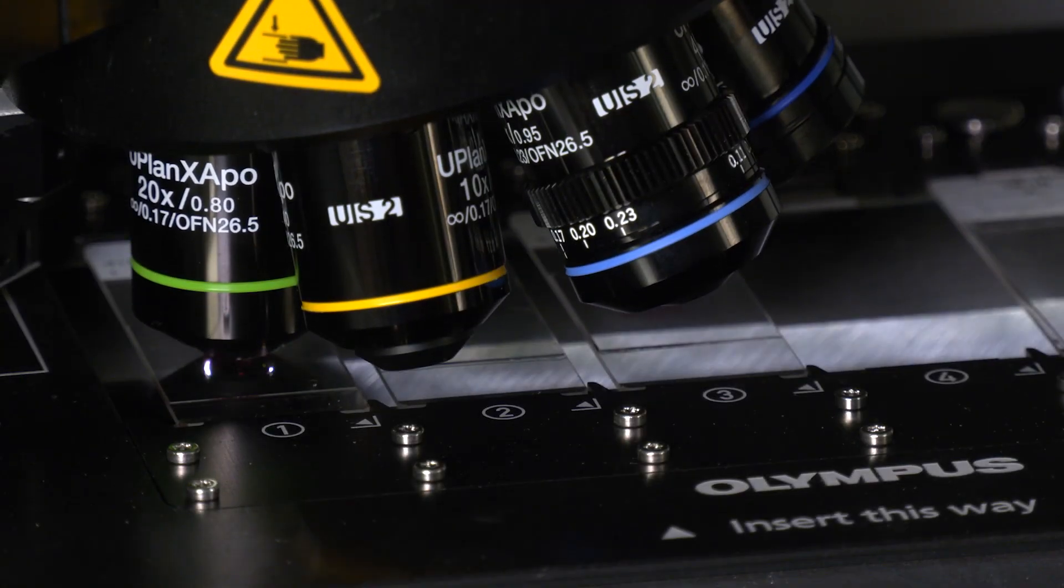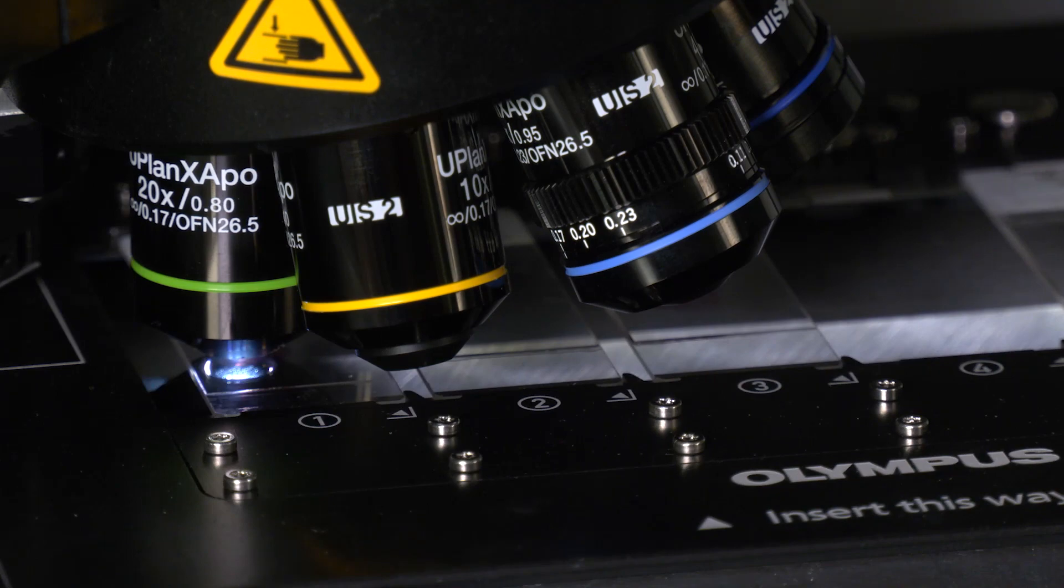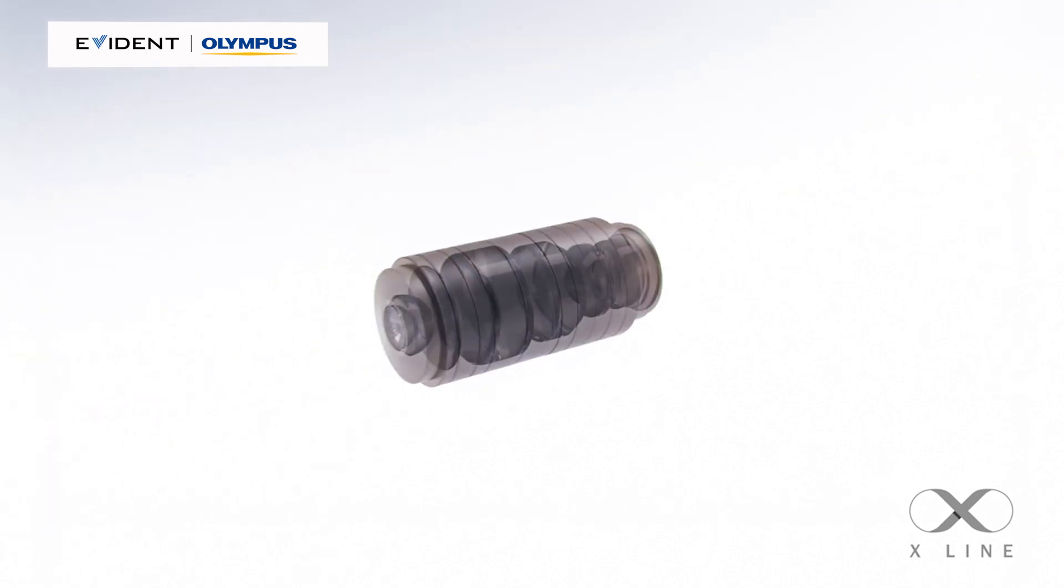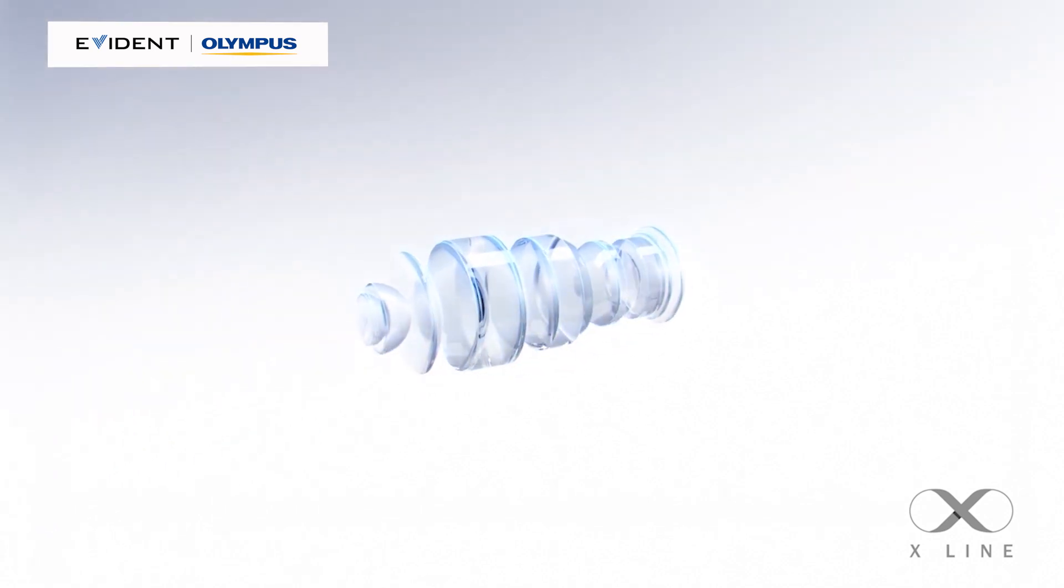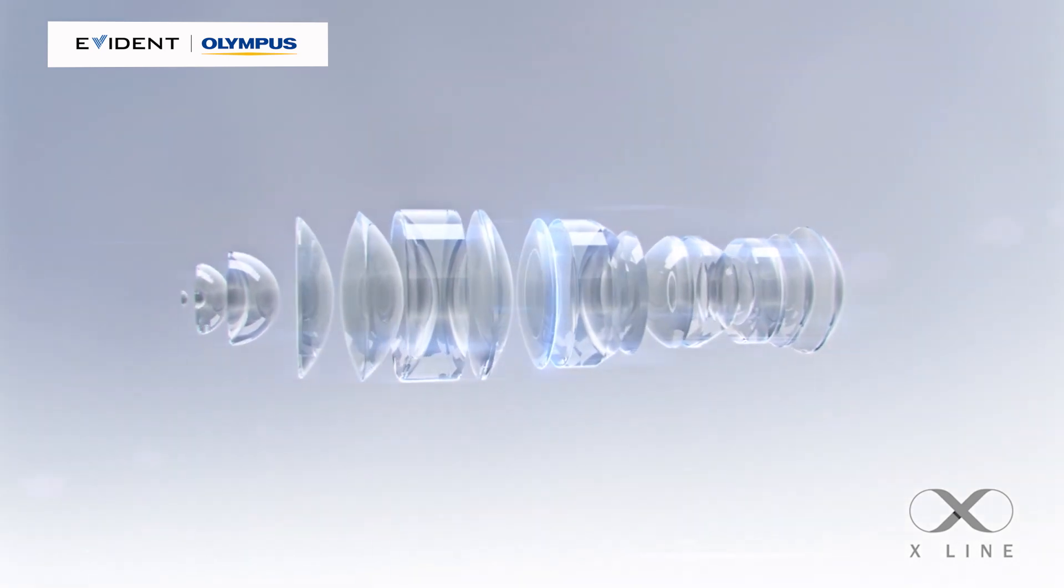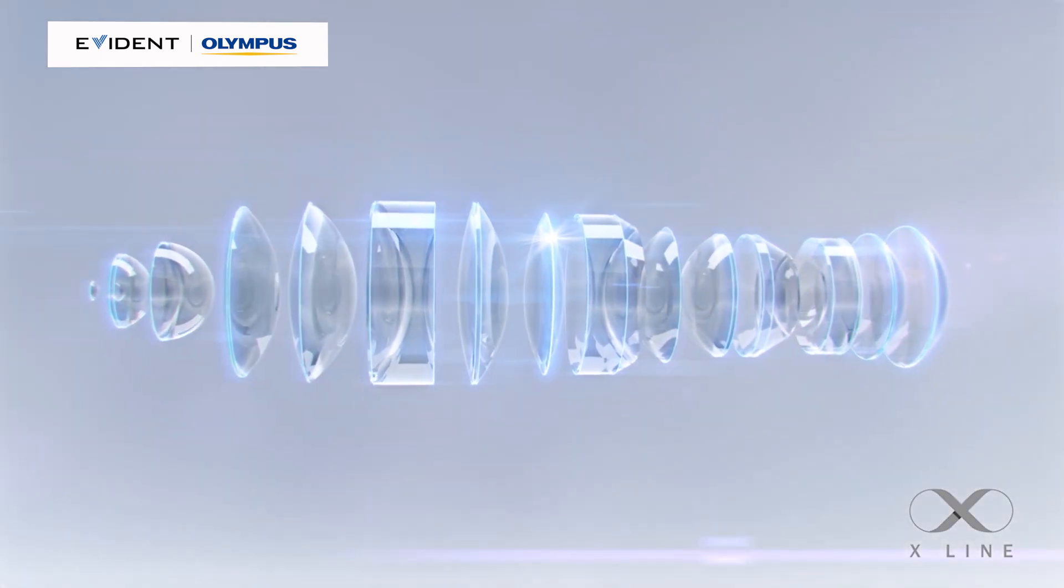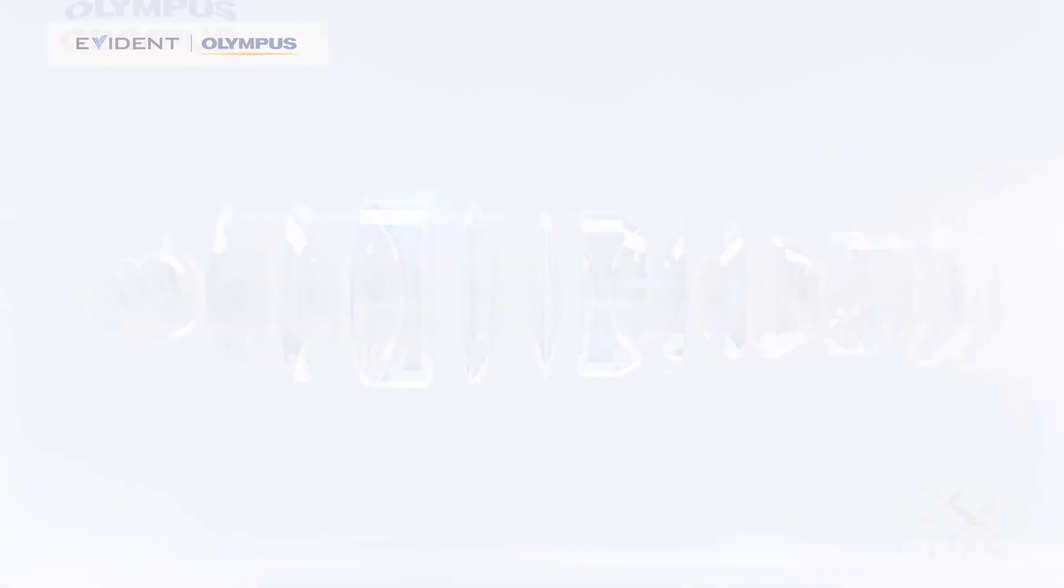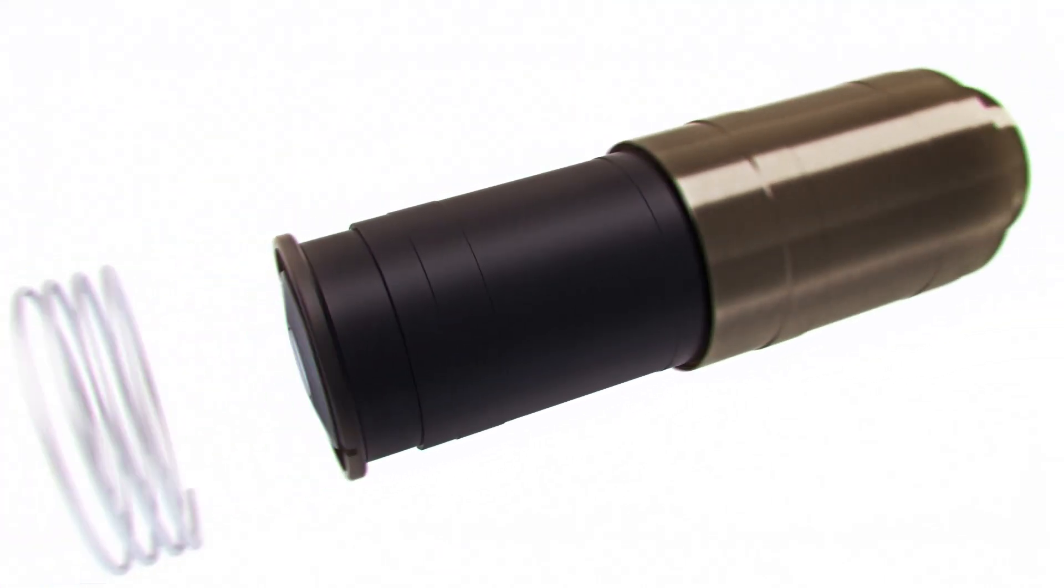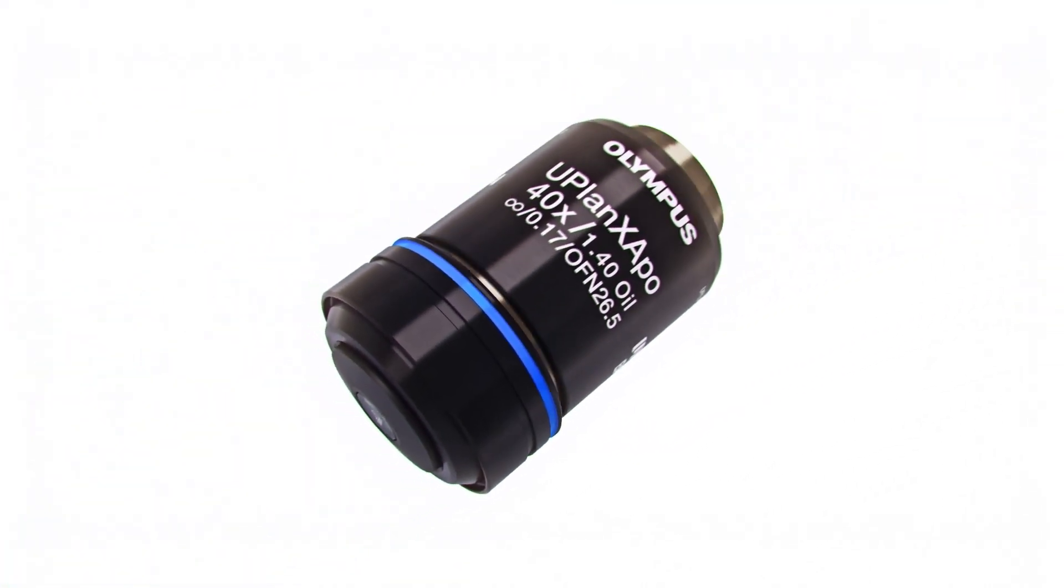X-Line objectives are based on the principle of perfectly polished lenses and complex physics. Our revolutionary manufacturing techniques produce ultra-thin lenses that can enable more optical correction within the existing barrel design. This aspect is critical because X-Line objectives are designed to improve upon the existing optical system of microscopes. This means that characteristics such as working distance and par-focal distances must remain the same.